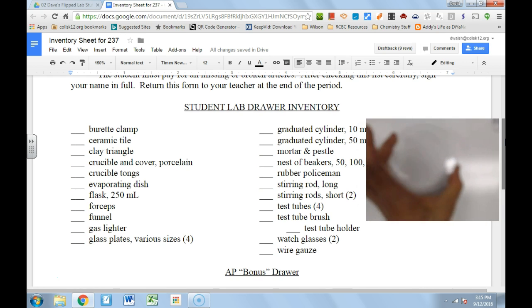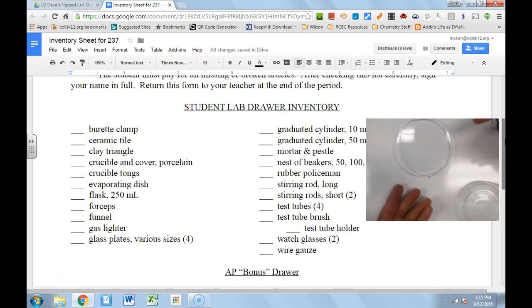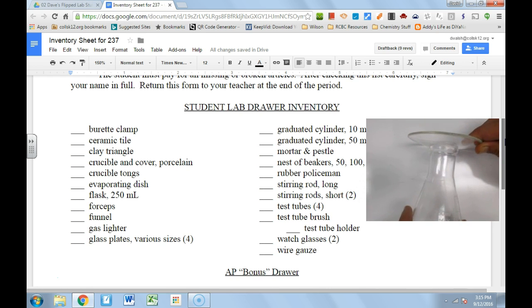We've got our watch glass, which is basically a circular, lens-shaped piece of glass. This is good if you want to put a substance on it and observe it very clearly. It also serves like a piece of square glass — you can use it to cover another piece of glassware.